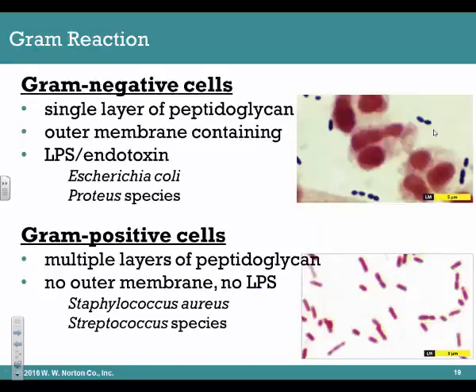So here are a couple of actual examples of light microscope images of gram-negative and gram-positive cells. Here you can see, and these are switched actually, the gram-negative cells are on the bottom here, some rod-shaped gram-negative cells, and the gram-positive cells are on the top, along with some red-shaped eukaryotic cells, maybe human cells if it was a sample from the mouth or the gums, for example.